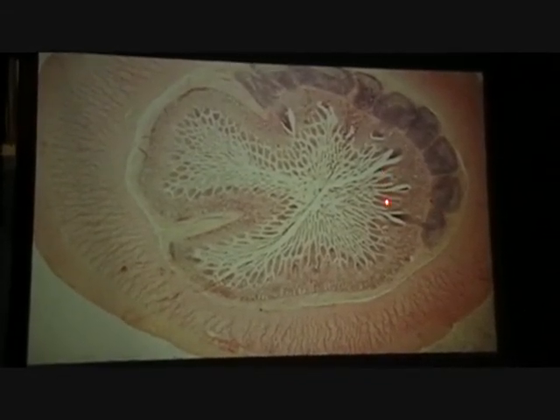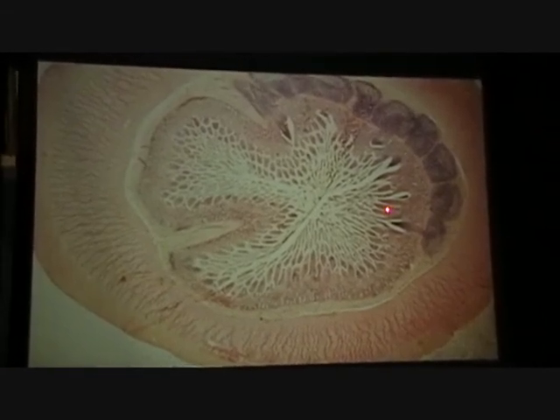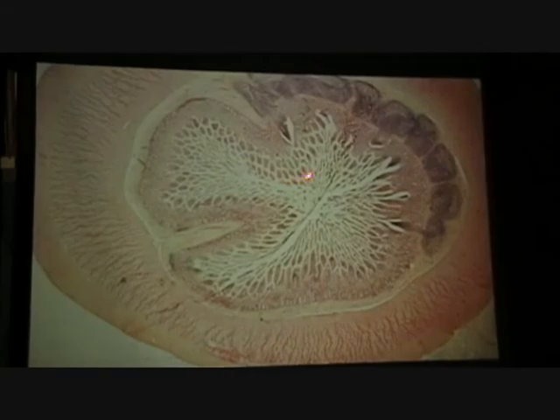These villi, but they're fragmented. Once again, third dimension allows you to figure that out.